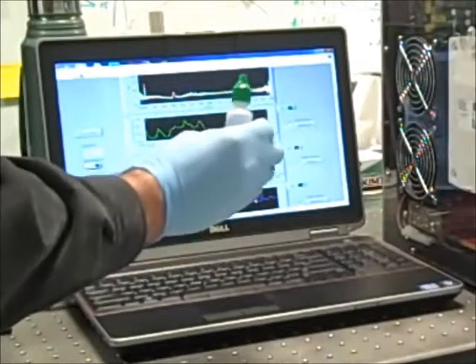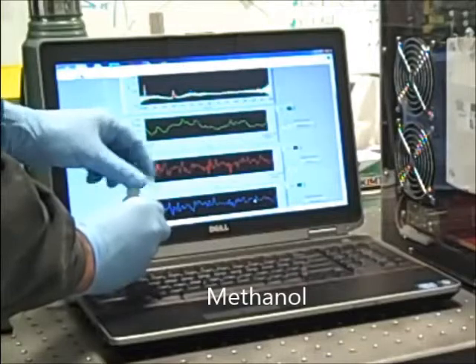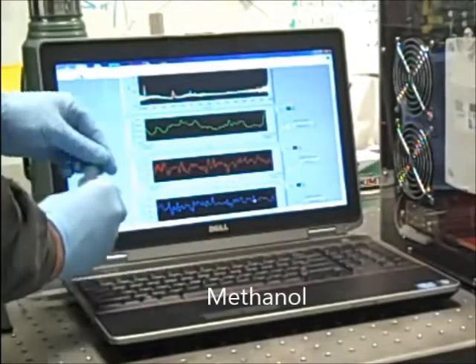For example, the green traces methanol, which is also what is in this bottle. By cracking open the bottle, methanol vapor is released, which is sucked into the system by intake fans.